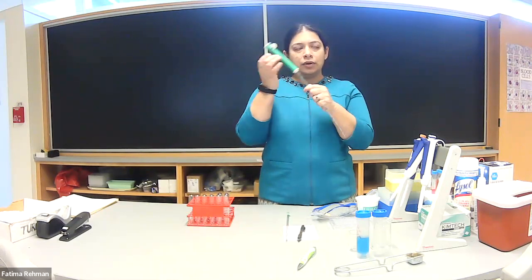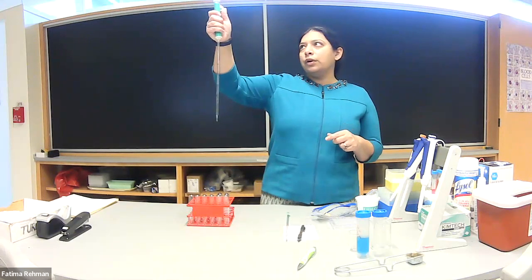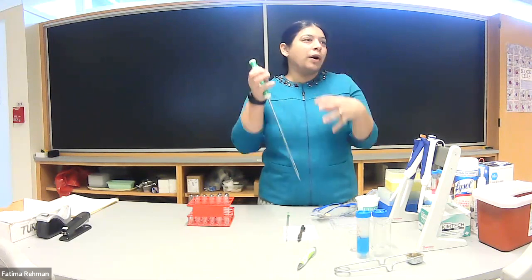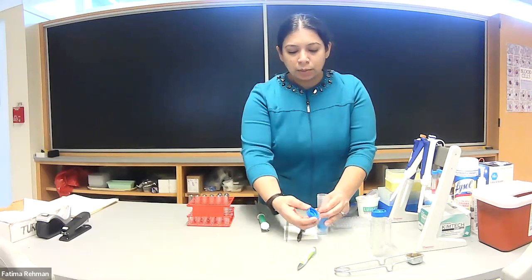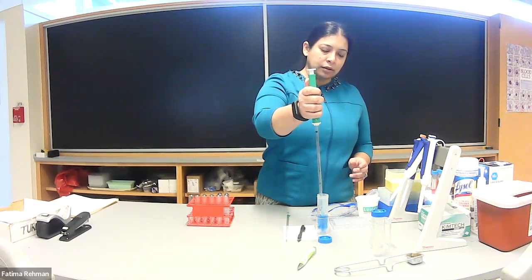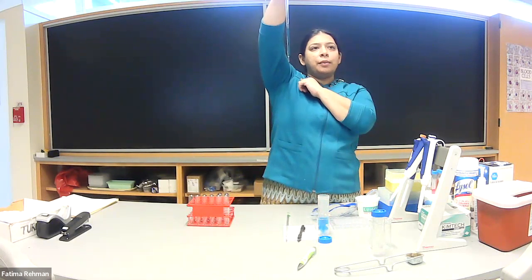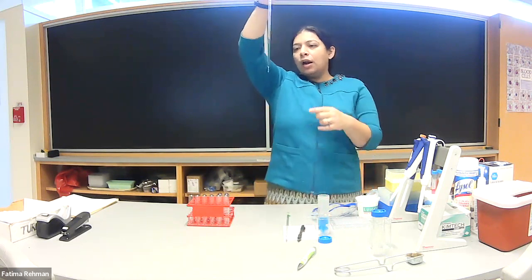You could just put the pipette into the liquid and start pipetting, but you'll notice when you release the volume there's a little bit of liquid left behind due to capillary action on the glass. Let me show you that first. I'm pulling up three ml — one, two, three. How do I know it's three ml? We read the bottom of the meniscus. It's basically a mini graduated cylinder.